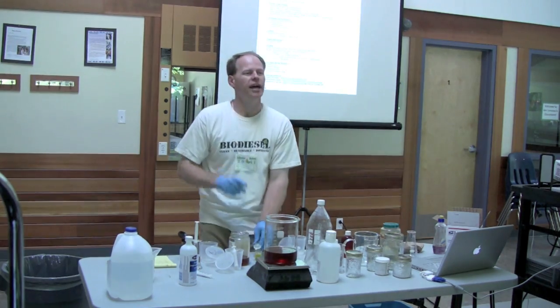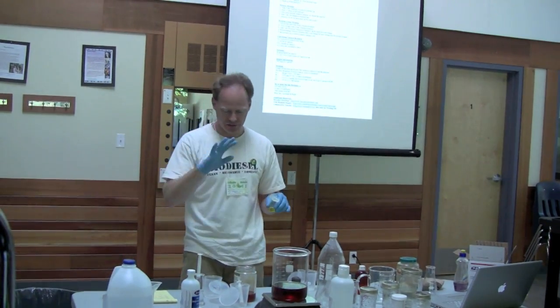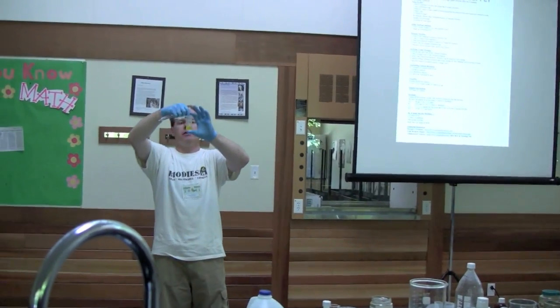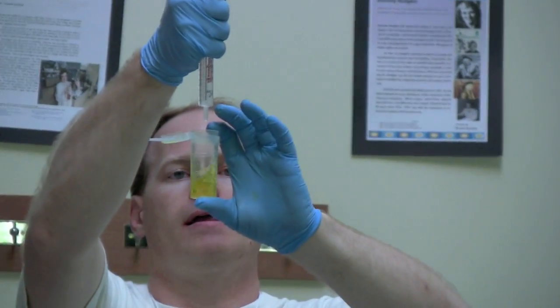And it's not a hazmat, and I can ship it to Canada. Phenolphthalein, I can't. And I love Canada. We've been selling a lot of stuff up here. You guys are doing great with biodiesel. Okay, we're going to do it with turmeric. It took 4 last time, right? Here we go. Let's see what happens.